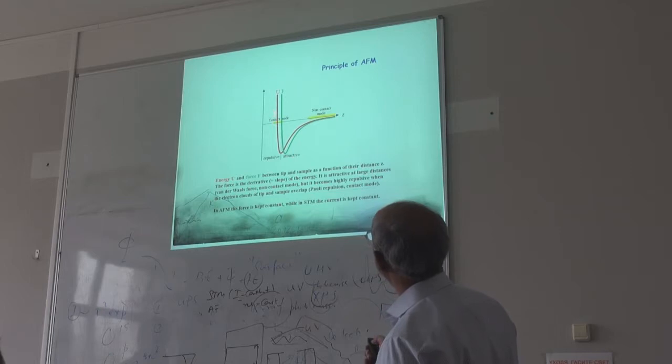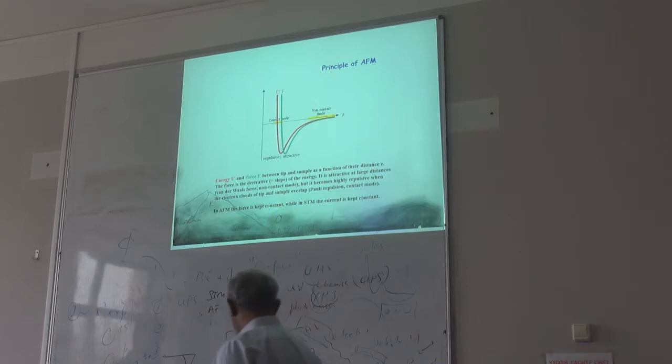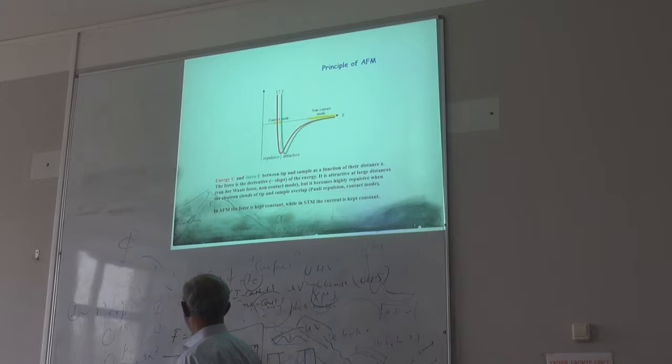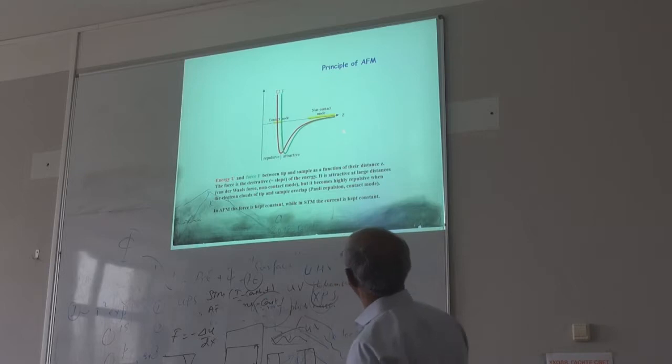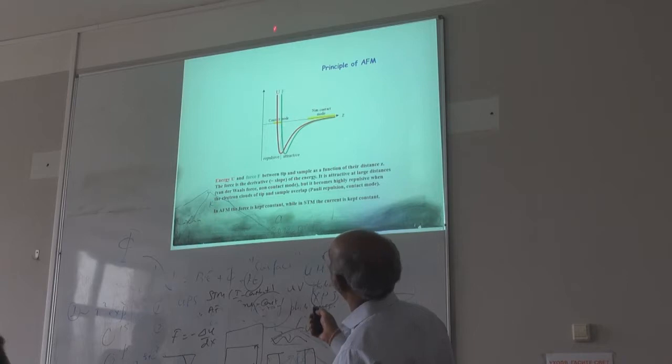You can see this, in this range, this becomes positive, this becomes negative here. So this is the force actually. Force is negative dE over dx, right? So depending on what mode, this is where you use the non-contact mode. So that is your force is negative. Yeah, in the contact mode, usually we use it in this way, in the positive mode.